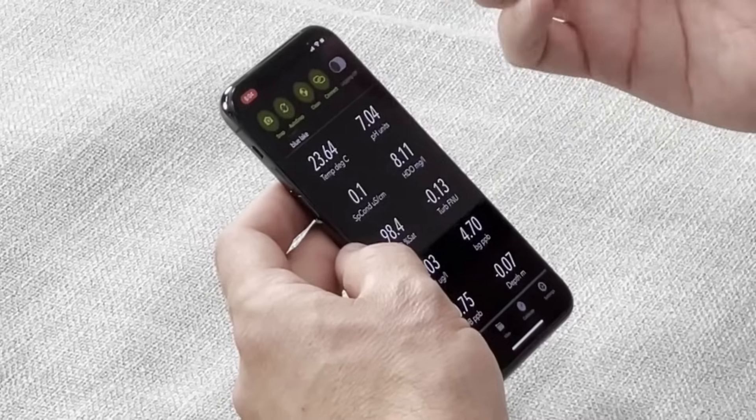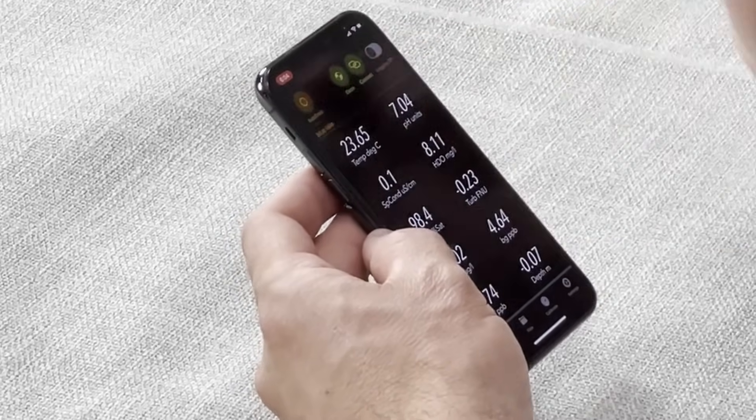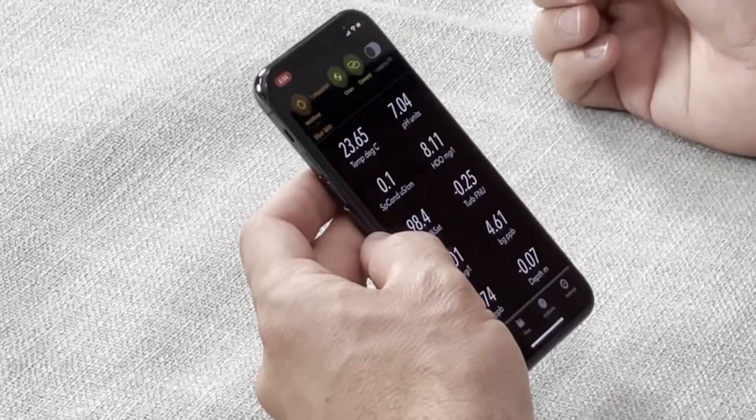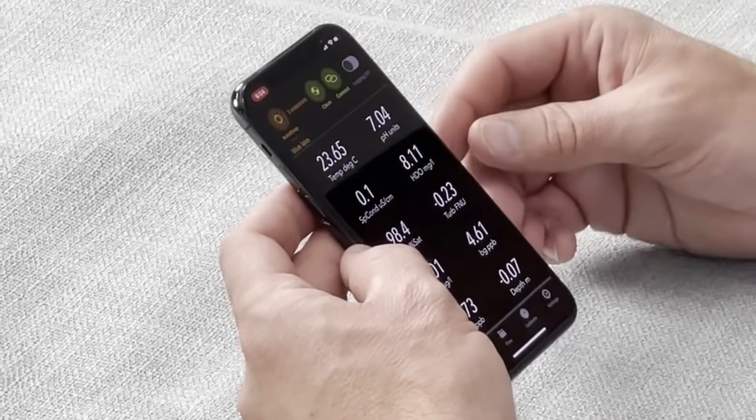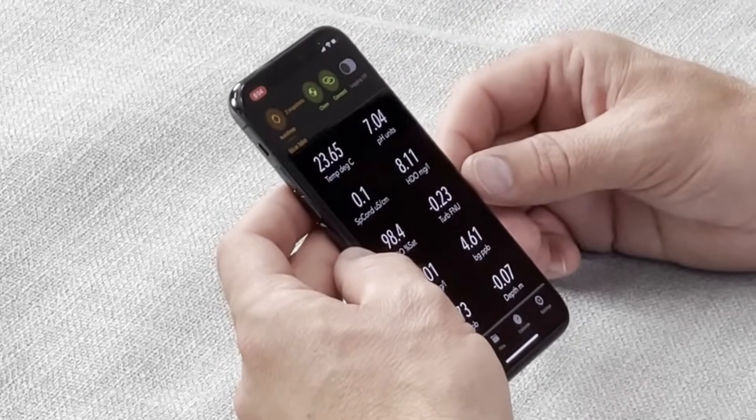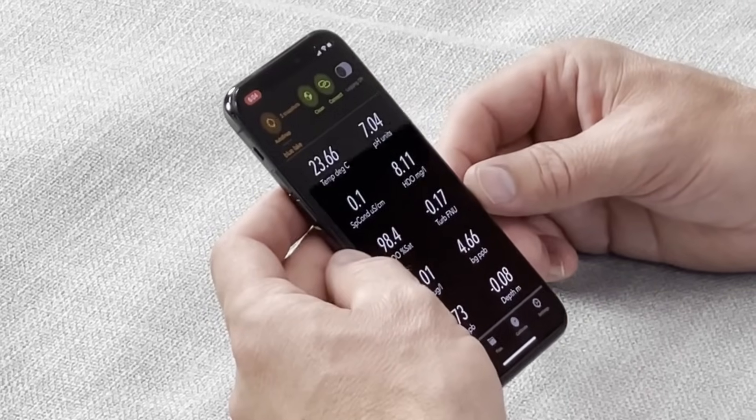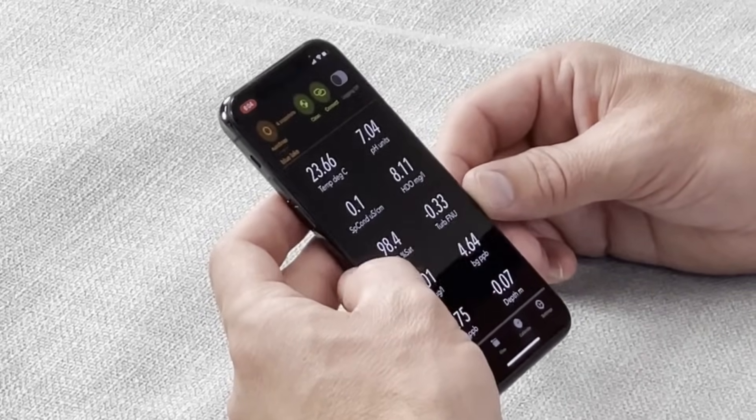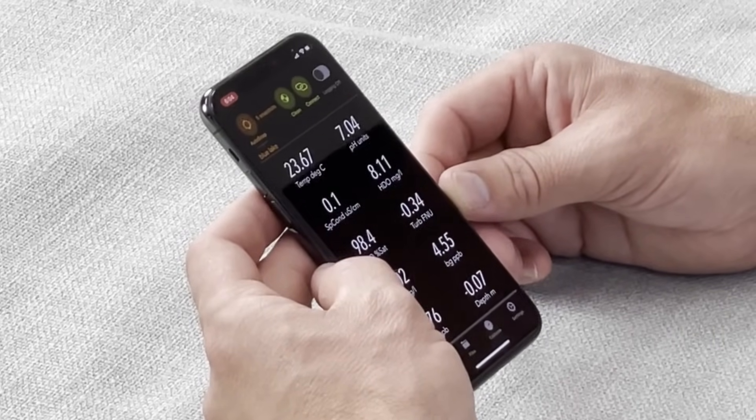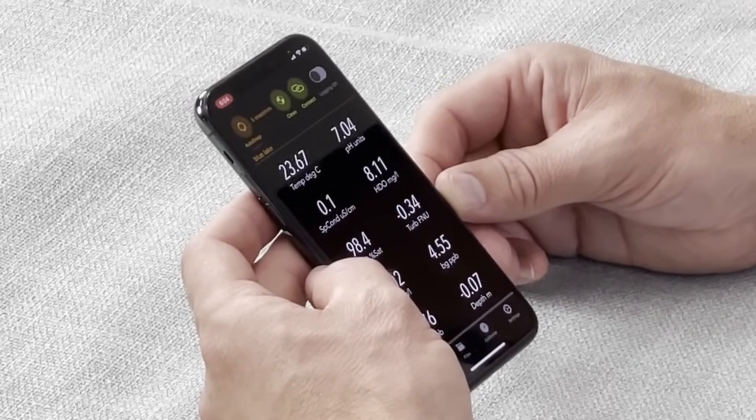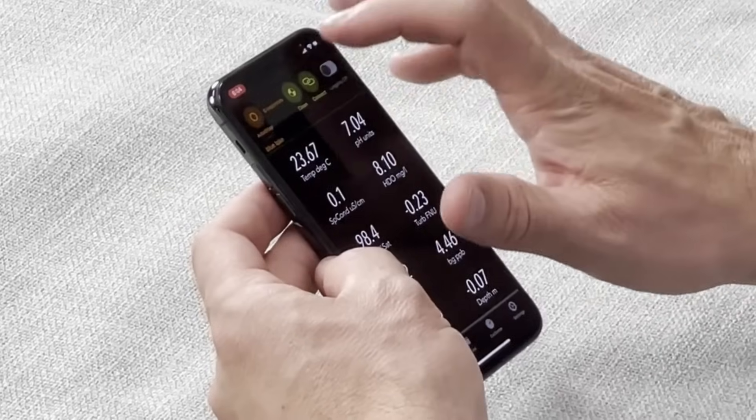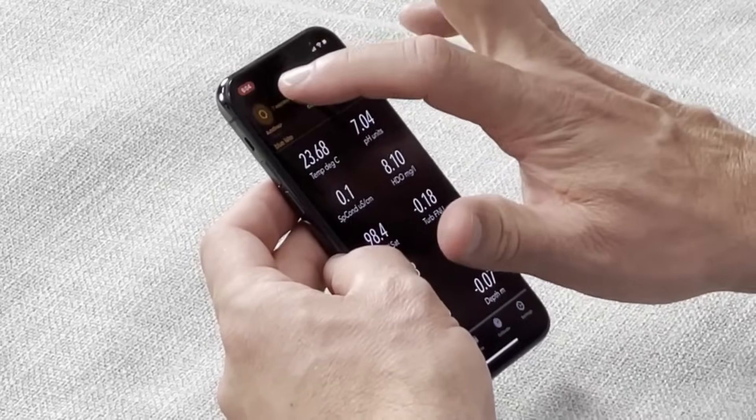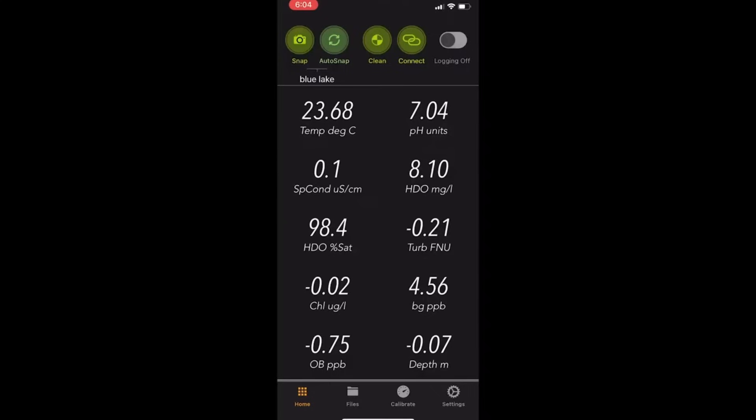If you use the autosnapshot function, this will take snapshots at the interval in which your multiprobe is set to. This is currently taking snapshots every two seconds. To turn autosnap off, tap it once again. You go back to your home screen.